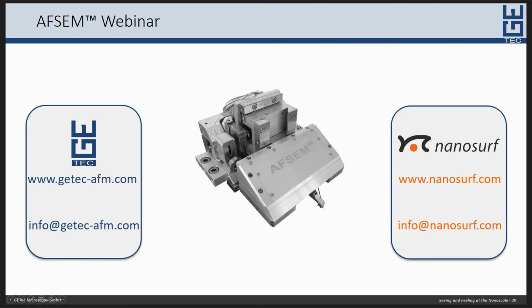Our customers have already performed the analysis of polymer samples, and in particular have made 3D analysis of these samples and determined the mechanical properties of the polymers in a correlative AFM nanomechanical experiment in the SEM.